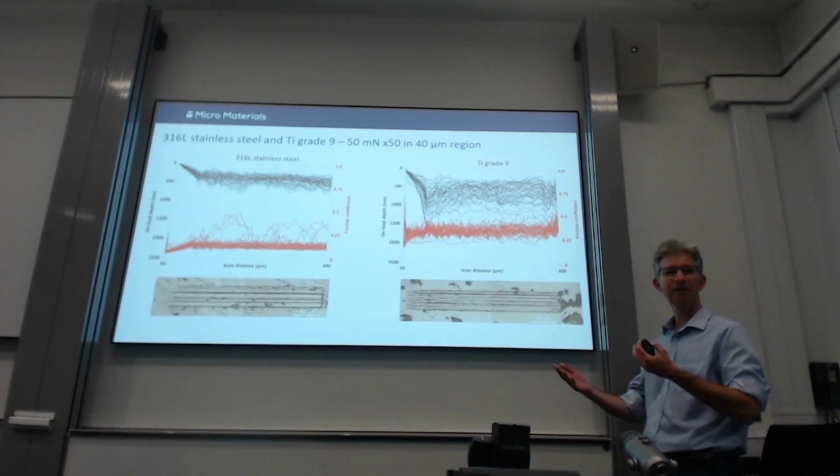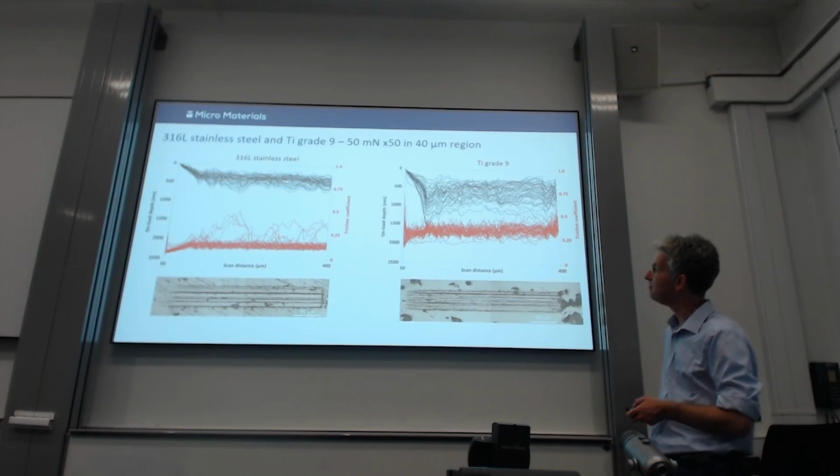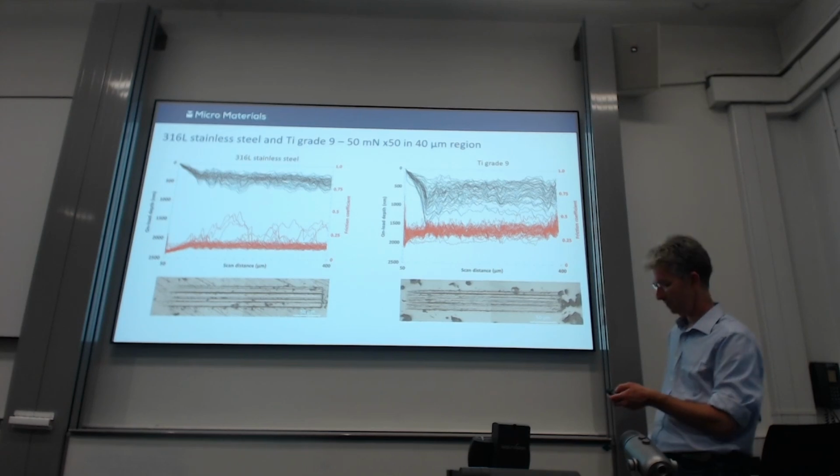So these are all very brittle things. What's also interesting is to look at it for alloy design. I'm trying to design abrasion-resistant alloys. These are just a couple of bulk alloys, fairly standard things that we've looked at as a sort of benchmarking exercise.